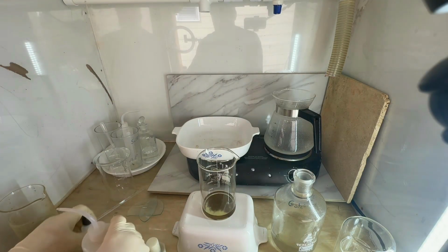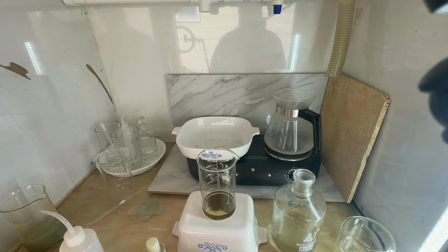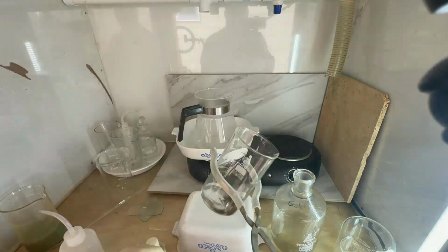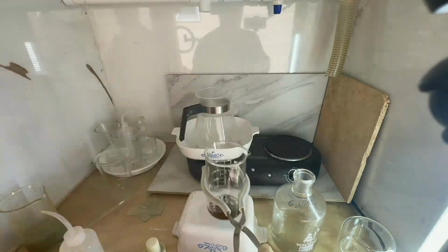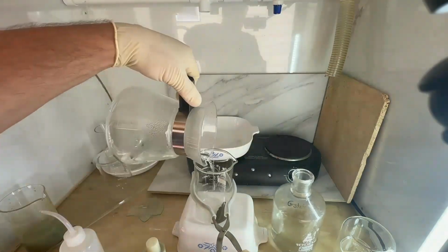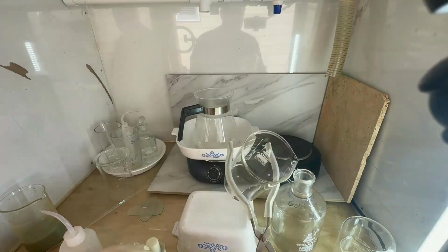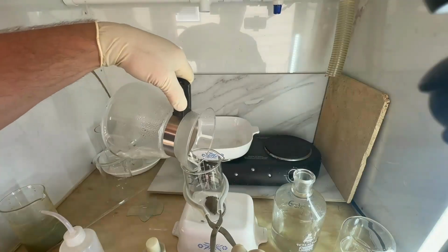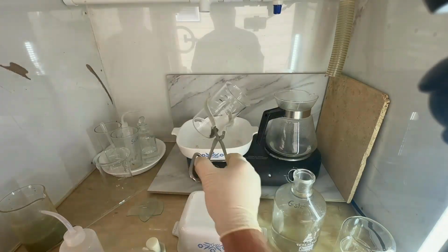And one thing you're going to see here is that as we decant off our acid, we decant off our water washes, the gold settles very, very quickly. The hydrochloric boil did a really good job of knocking that down and clumping it together. So we're going to go through several of these boiling water washes, get as much of that acid, or all that acid, off of there. We could refine this again, but we're going to go ahead and just dry it.